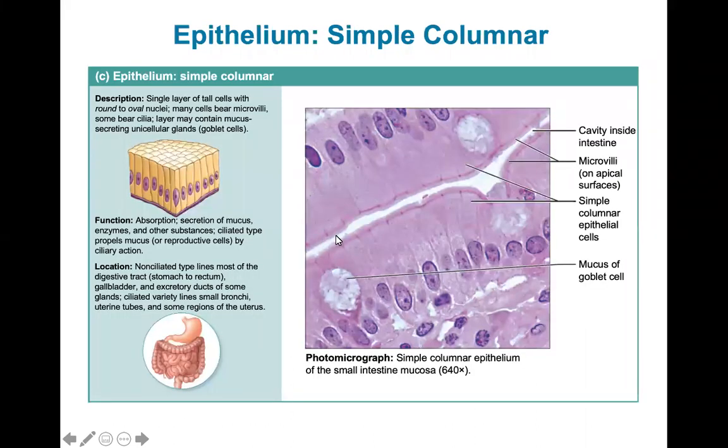And here we have two surfaces or two simple columnar tissues. This looks like an invagination within the intestines. And we can see column-like cells all lined up here. This would be the connective tissue underneath. When you get to the connective tissue, it looks messy. It's not as uniform. So this would be the basal surface down here, okay? This would be our apical surface here. But on this tissue, this is the apical surface here, and then our basal surface would be here, okay?